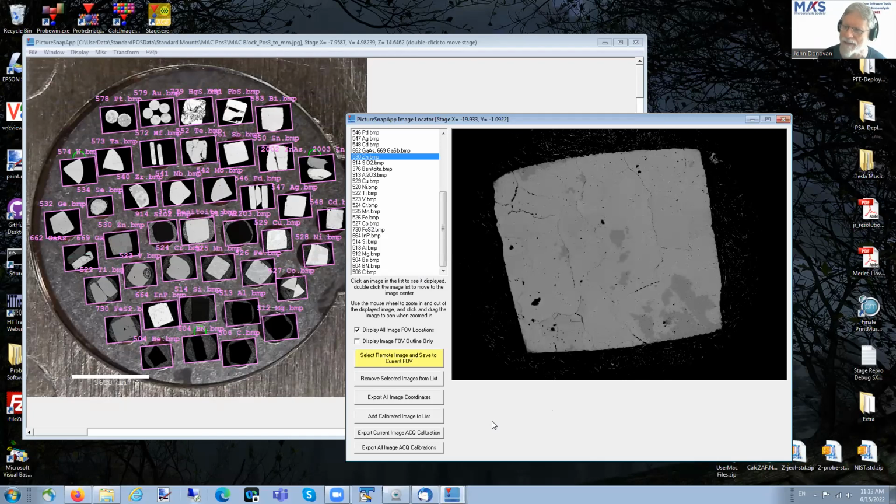You want to make sure, though, that you have your calibration points visible in the multiple techniques. So whether it's optical or some kind of electron imaging, you want to make sure you choose points that can be found. And that could mean even scribing little points on your sample.